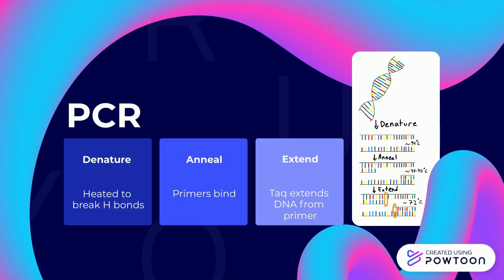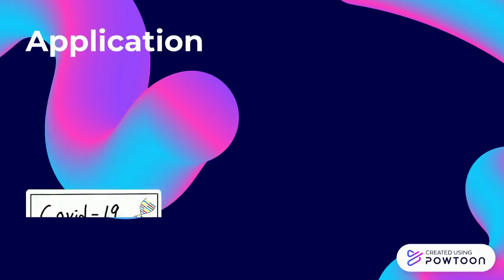Qualitative PCR determines the presence or absence of a certain gene. It can show if a pathogen is present, while quantitative PCR can detect and quantify the amount of a particular gene's presence. This is also known as qRT-PCR, which detects and quantifies the product of PCR in real time while being synthesized. PCR can be applied to many different fields.